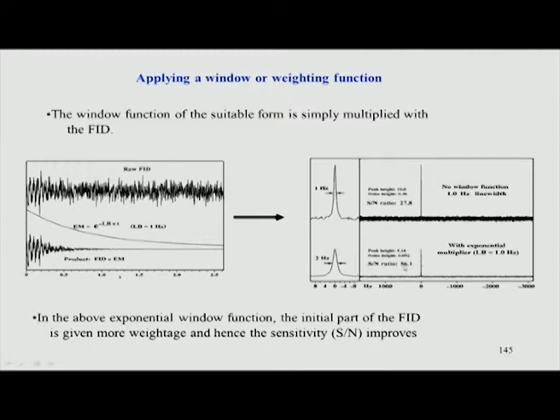So, why has the signal height gone down? The signal height has gone down because the peak has become wide, the peak has become broad. Earlier the line width was 1 hertz, and here it has become 2 hertz. So, obviously the height will go down. Remember, in NMR the area is always constant, because the area under the peak gives you the number of hydrogens. So, for the same sample, whatever I do, my area under the peak should not change, because that is the important point, since that is what I need for my quantification.